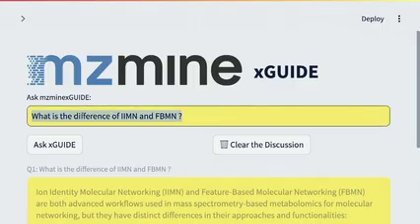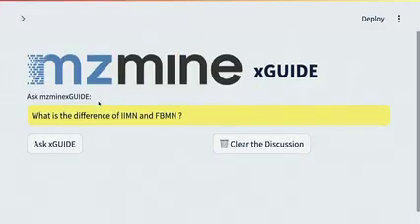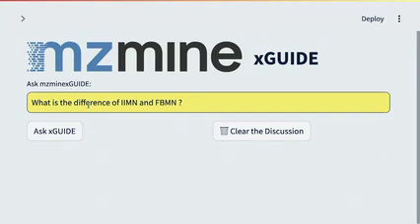Thank you, Louis. And that's also important why documentation and all the other resources that we build are so important, right? Because then it's findable, and we can really reuse that. And again, the documentation of MZmine, also GNPS and other tools, they are usually open. And that really means that you can not only consume them, but you can also add to them, right? So you're the experts actually using the tool. And so it's sometimes good to know, oh, there's a little issue, and I can add some information so that people can get to working faster.